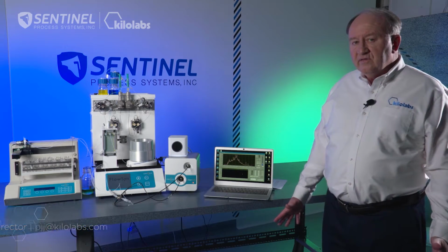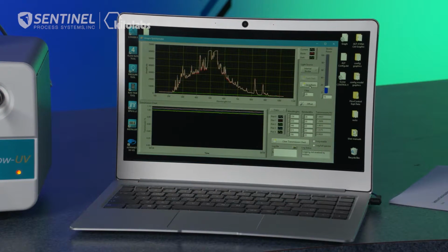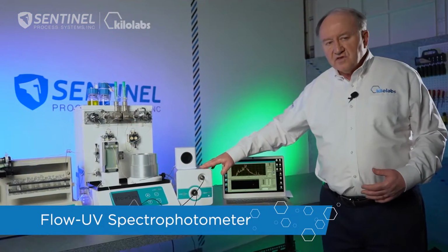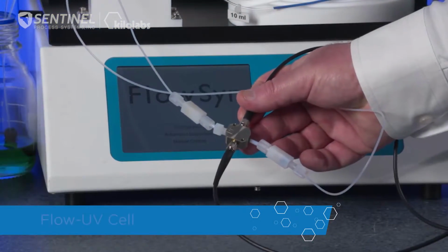The overall FlowUV system consists of 3 components. We have the laptop for data acquisition and looking at the graph of the UV signatures that goes through the flow cell. The spectrophotometer itself is actually doing the measurement. And the last component is the FlowUV cell.